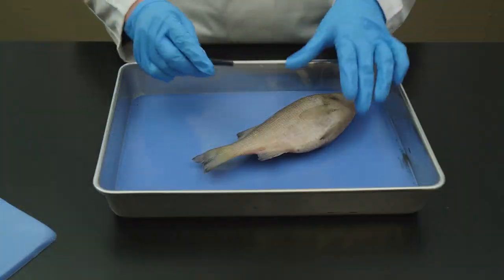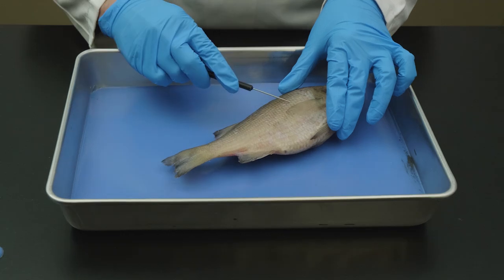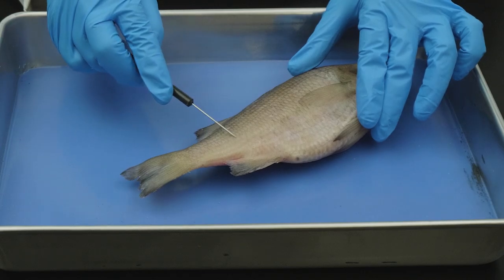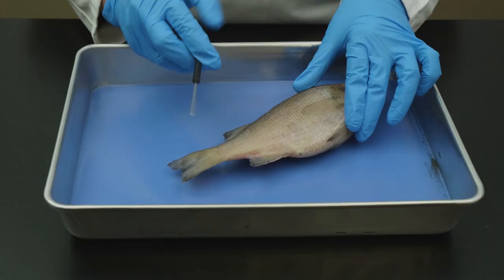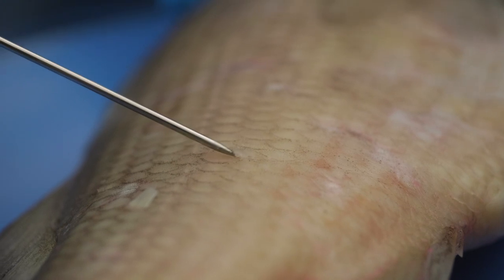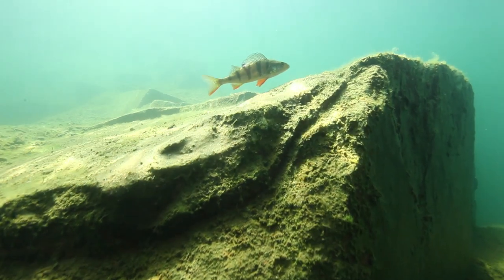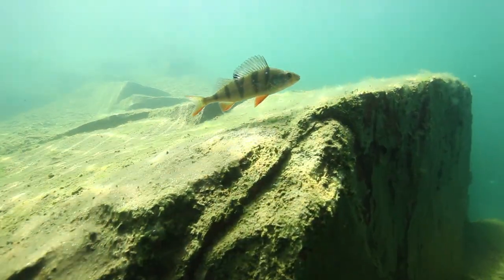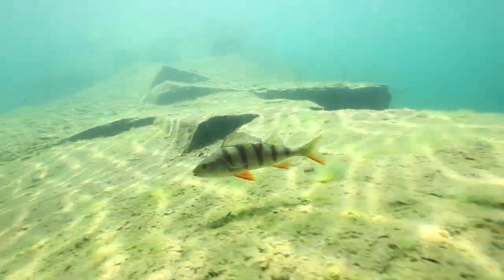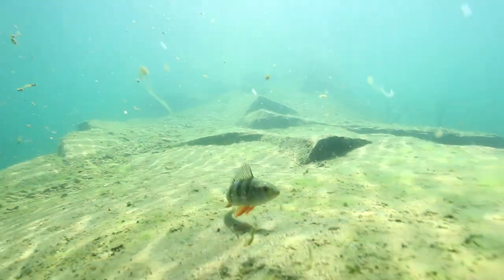Notice what happens when we slide a probe along the lateral surface of the perch. When we slide the probe in this direction, it glides smoothly over the scales. But if we move in the opposite direction, the probe catches on the scales, and some of them flake off. A fish's scales were designed to lay flat to provide a streamlined surface to help the fish glide through the water. Now, let's look at some other features of the perch's external anatomy.